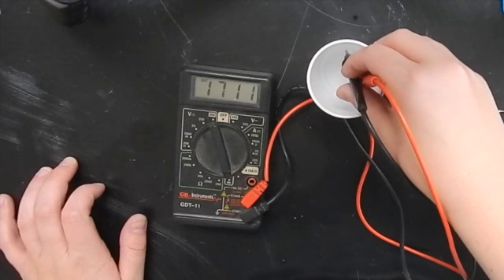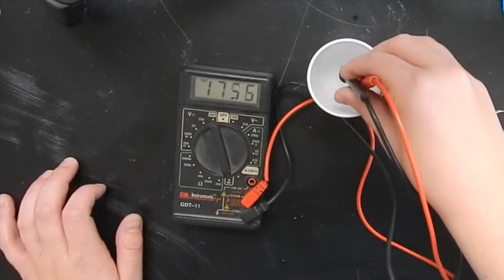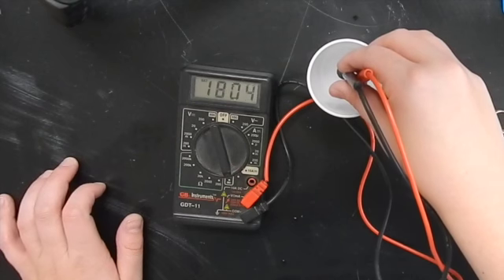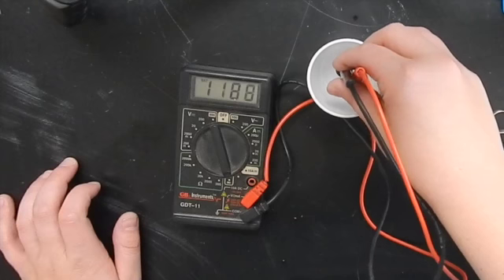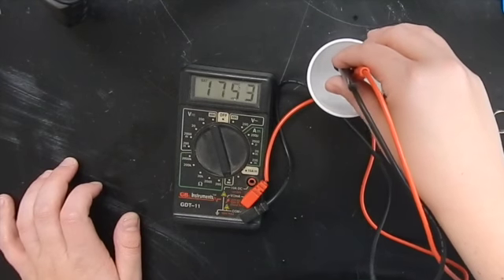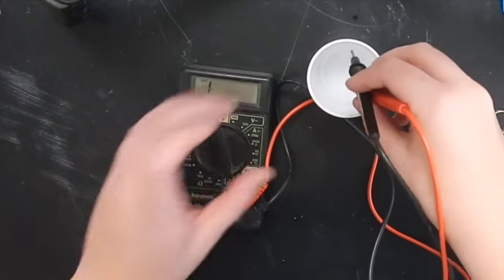you see it's about 1790. So use this information to fill in whether it conducts a lot of electrical charge for unknown number 1.